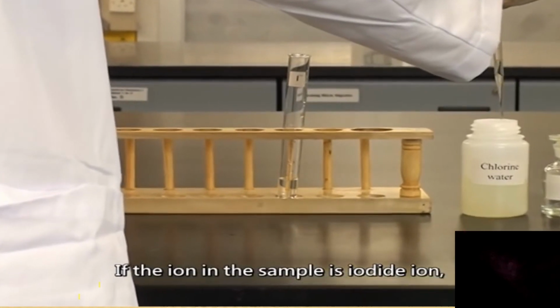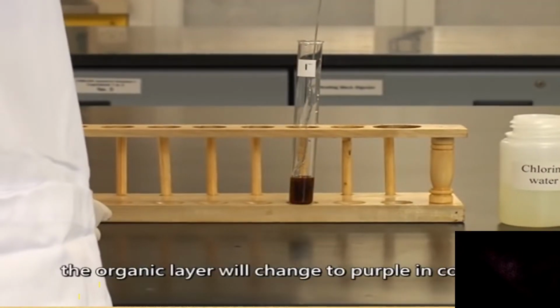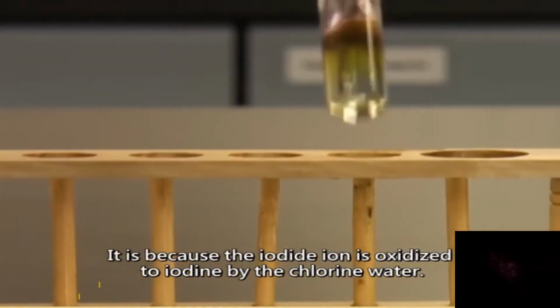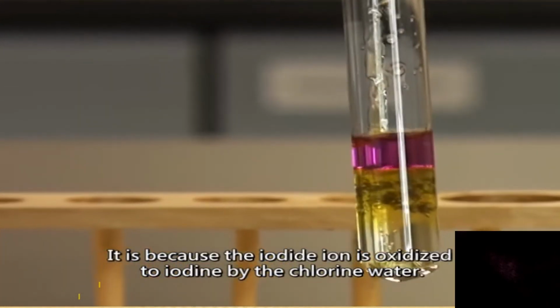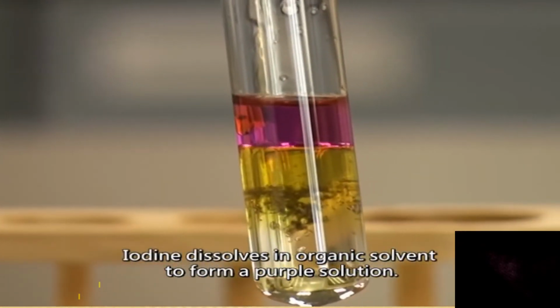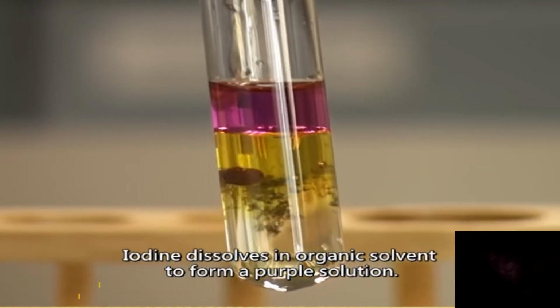If the ion in the sample is iodide ion, the organic layer will change to purple in color. It is because the iodide ion is oxidized to iodine by chlorine water. Iodine is dissolved in organic solvent to form a purple solution.